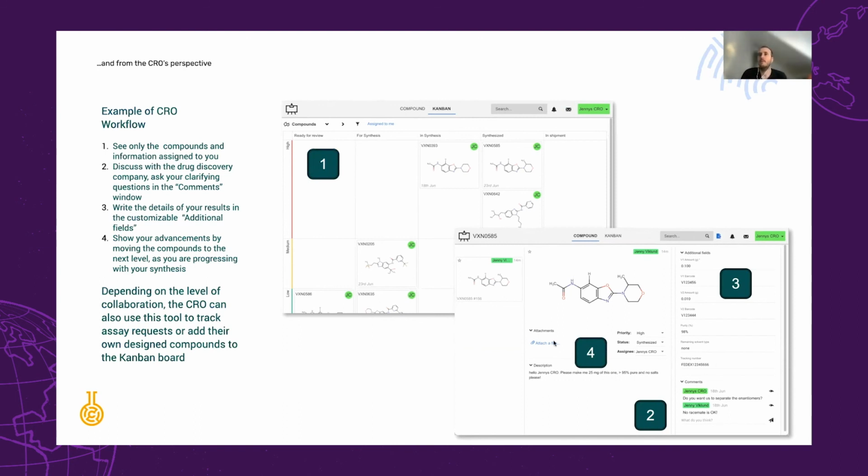The compounds with the data that we want to share are there, like the requested amounts and the purities and any special information related to shipping. But our internal classification models do not really show anymore. And the focus is on providing structured information to the designer of the compound, what amount we have been able to make, what the barcodes of some of the vials are, and what the shipping label is.